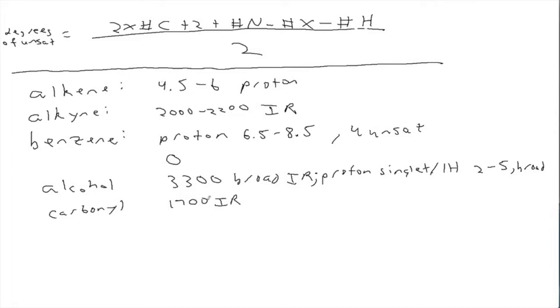That's a very distinctive and helpful thing to look at. What are some specific functional groups that have carbonyls in them? Carboxylic acid. That's right. So if we're looking at a carboxylic acid in particular, what would be a distinctive way to recognize that you've got a carboxylic acid? You have a carbonyl and an alcohol. So on the IR, you see the... Okay, good. Anything else?